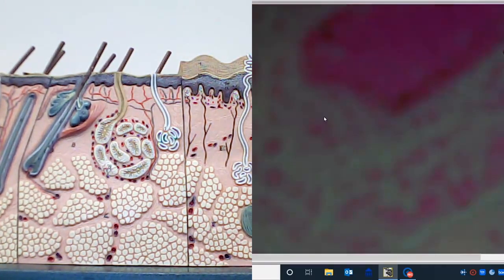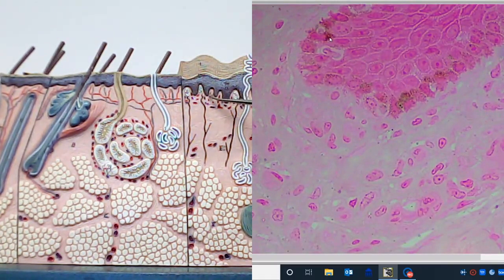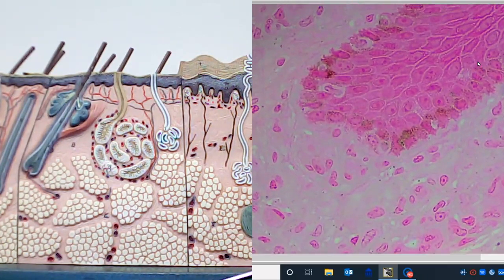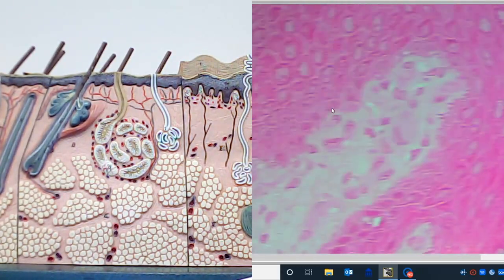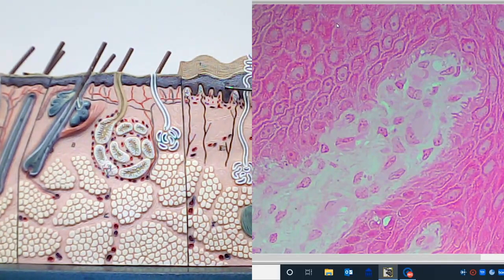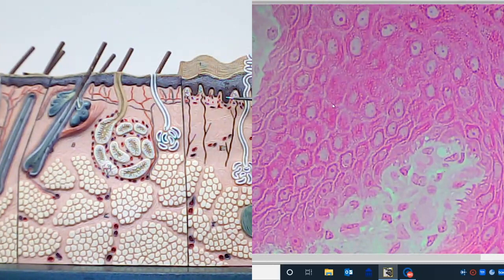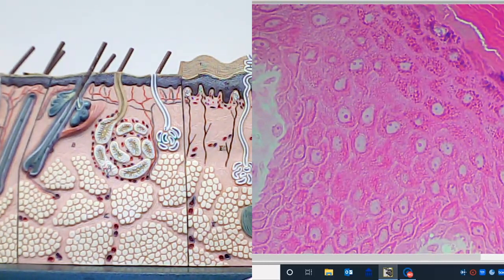At the 40x objective, we can see that we are starting to develop melanin granules, and we have actively dividing keratinocytes down in the stratum basale. We can see cells called melanocytes that are producing that melanin, which accumulates to protect the keratinocytes from ultraviolet light. As these actively dividing cells in the basal layer push outward toward the apical surface, they begin to change and we get a layer of cells called the stratum spinosum. These cells are called the spinosum layer because of their spine-like appearance. Moving toward the apical surface, the spine shape changes and the cells begin to fill with granules — this is the stratum granulosum.